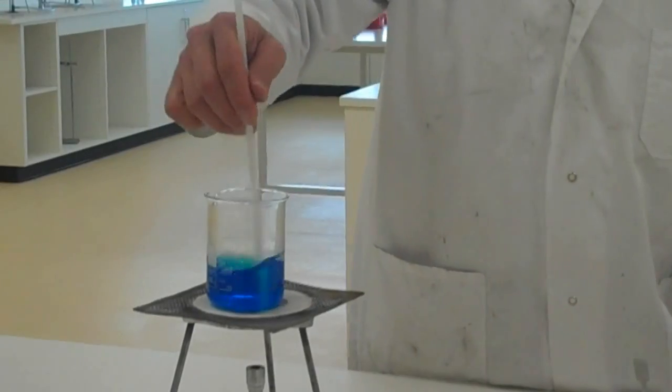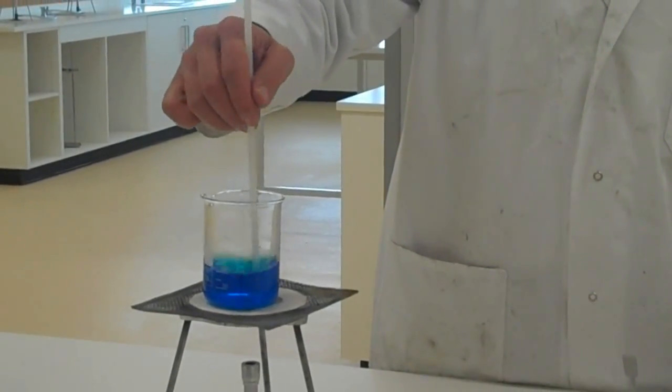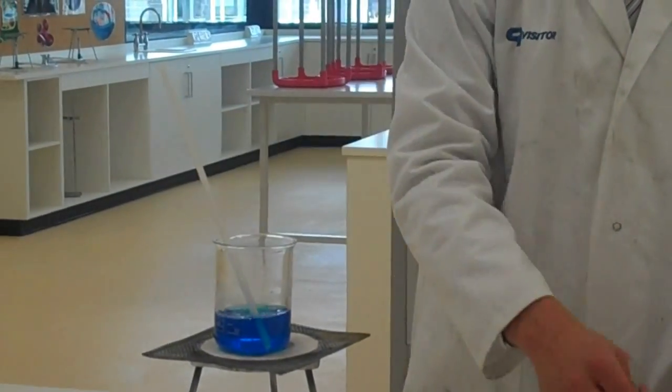That's all dissolved, and that's a saturated solution. I don't think I'll be able to dissolve any more copper sulfate in there, so that's done.